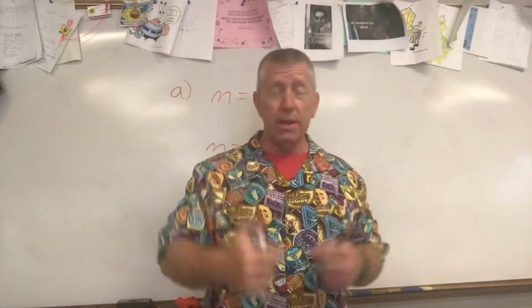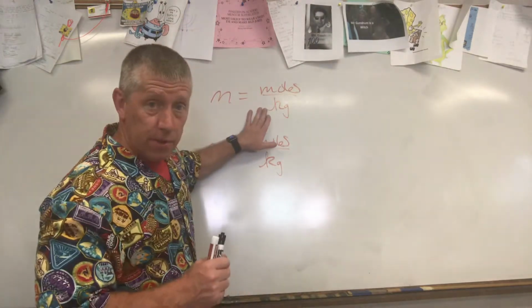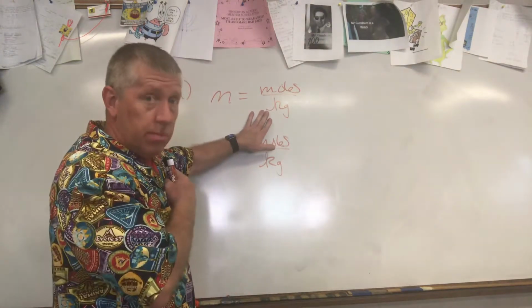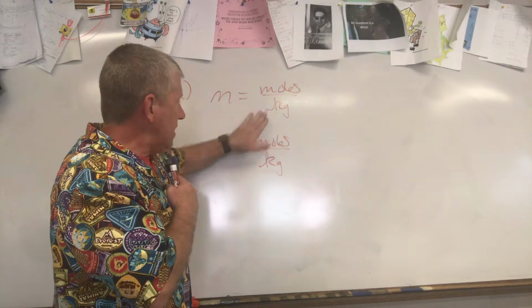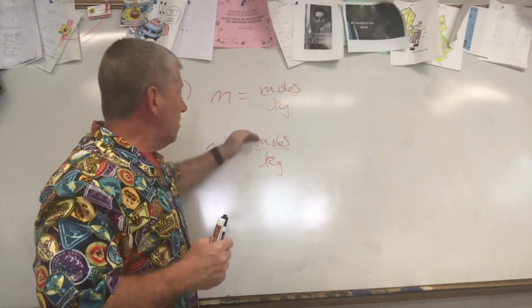Now, we all know that you and I together, lab partner, very accurately measured out 50 milliliters of water. What's a milliliter of water equal to? Very good, lab partner, a gram of water. So 50 grams of water is what we used. So put that in kilograms, and you get that in kilograms on the bottom for the water that we used. This is going to be a mole calculation.